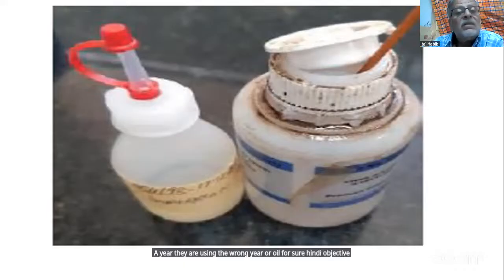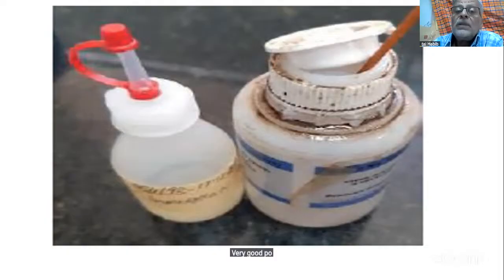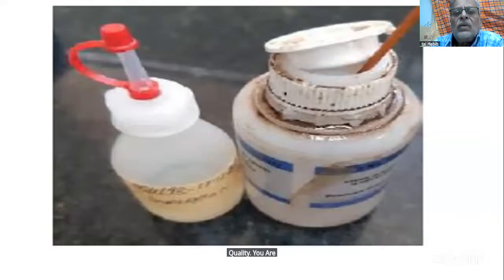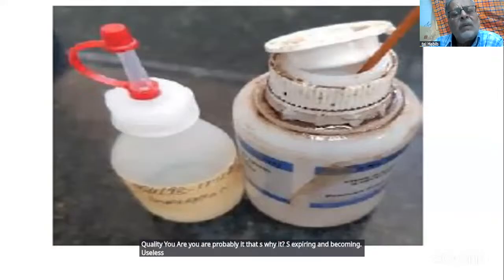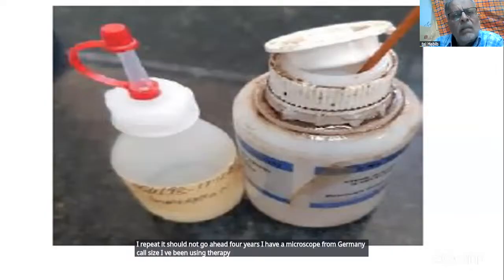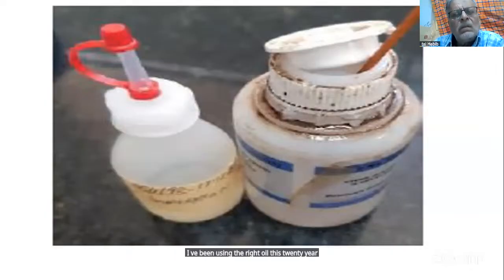That objective is very good quality, especially if it is Olympus CX23. Even the Chinese power 100 is a very good quality. You are troubling it. That's why it's expiring and becoming useless after 1 year. It should not go bad. Not, I repeat, it should not go bad. For years, I have a microscope from Germany called Zeiss. I've been using the right oil. It is 20 years old. Nothing has happened to my objective.